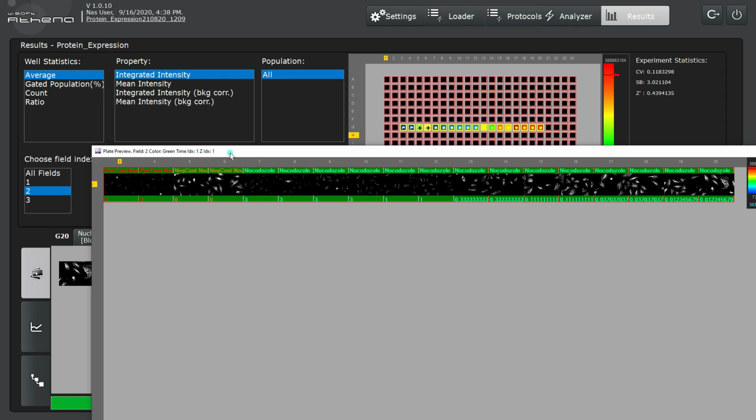If the contrast settings are not manually defined prior to Plate Preview visualization, then each image will have the contrast range detected automatically according to the distribution of pixel intensities in that image. But, since we've previously defined the contrast settings, we can visually compare them in this fashion.